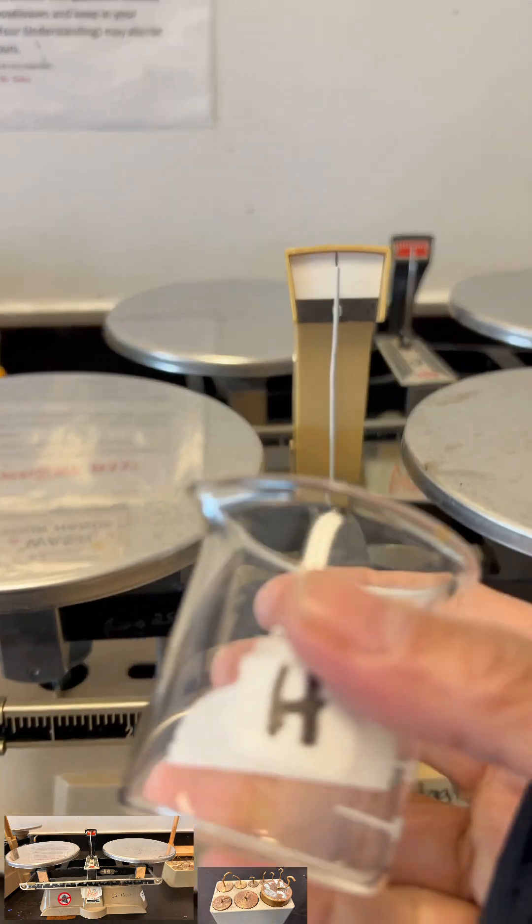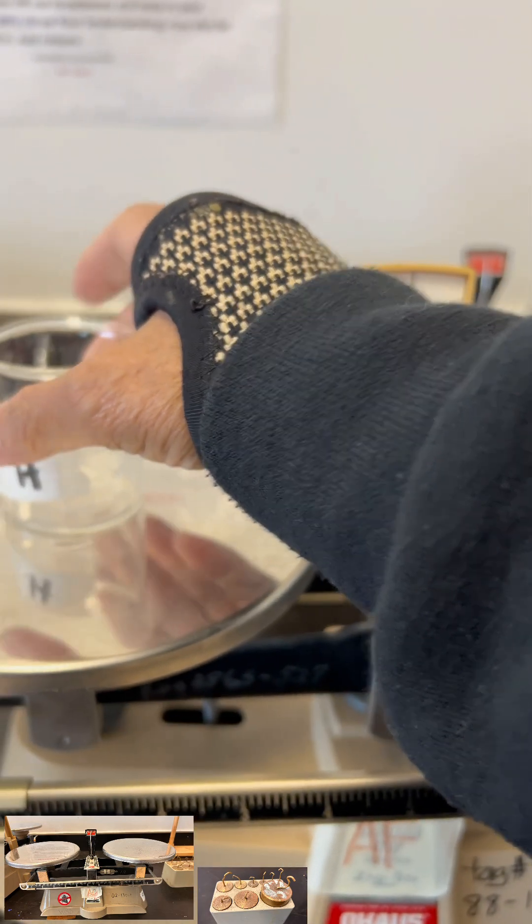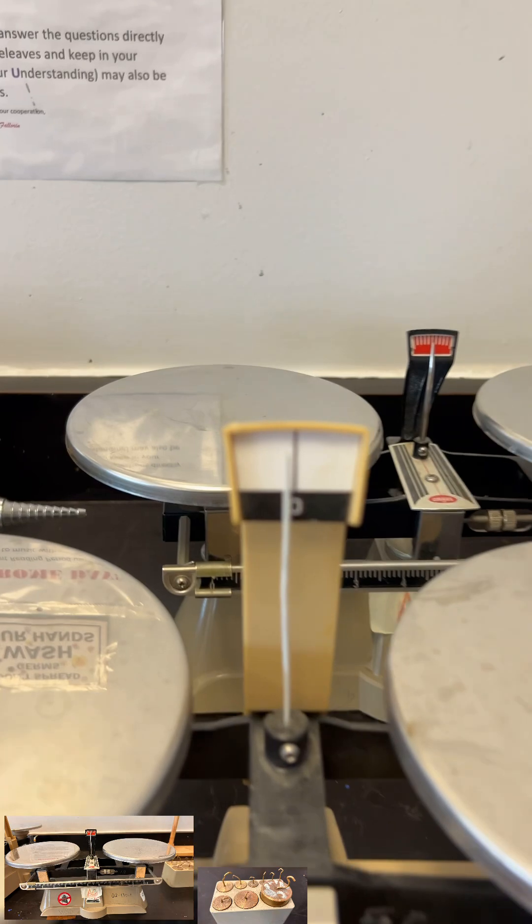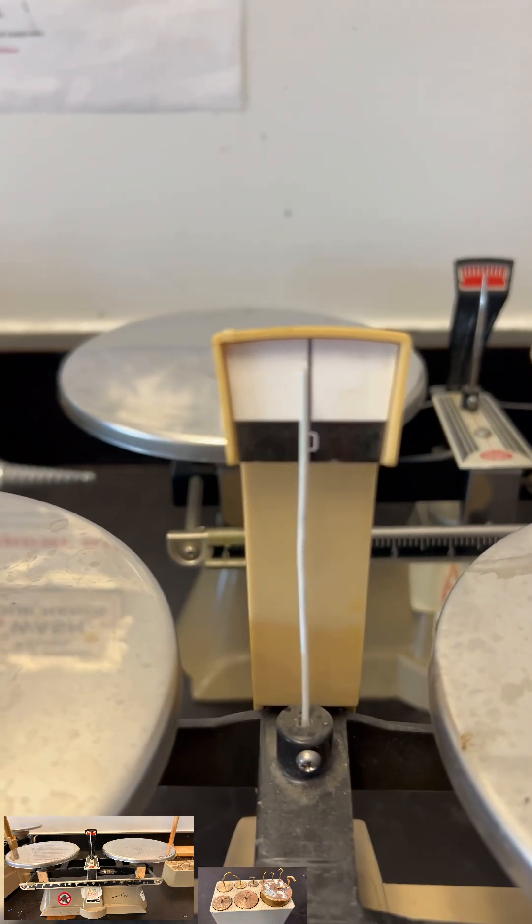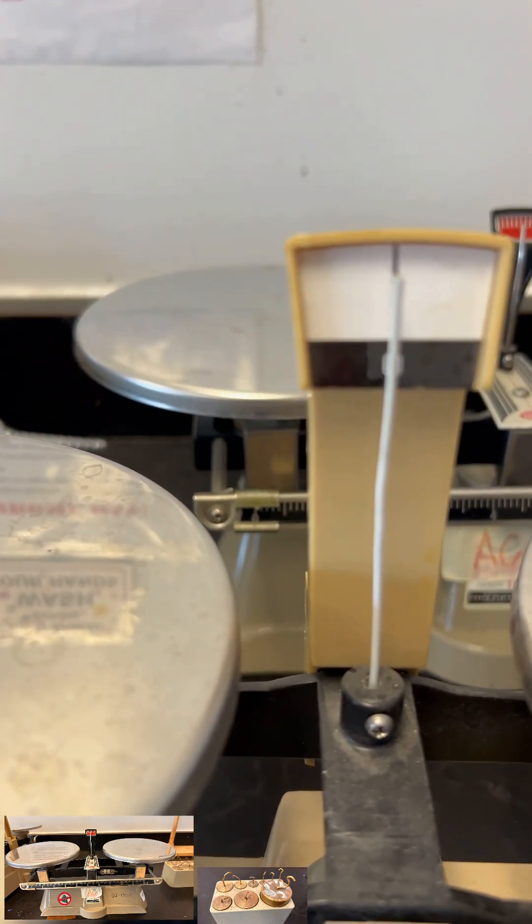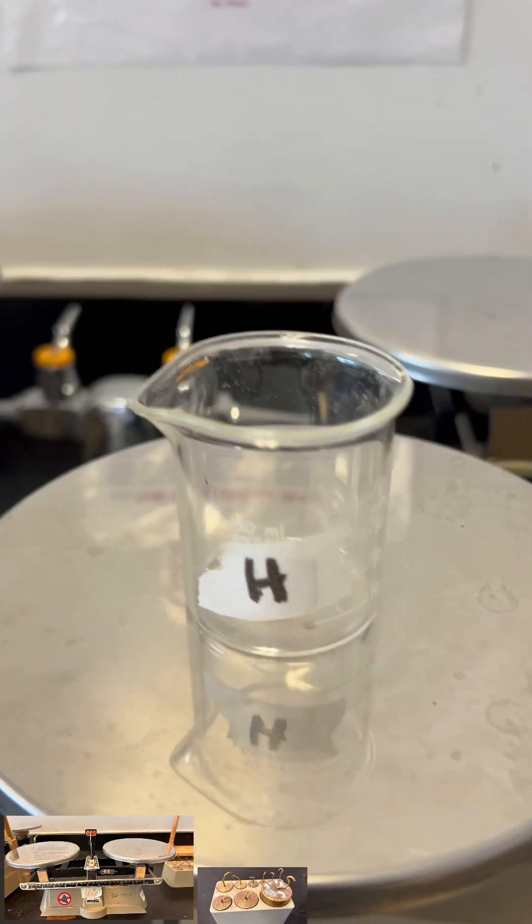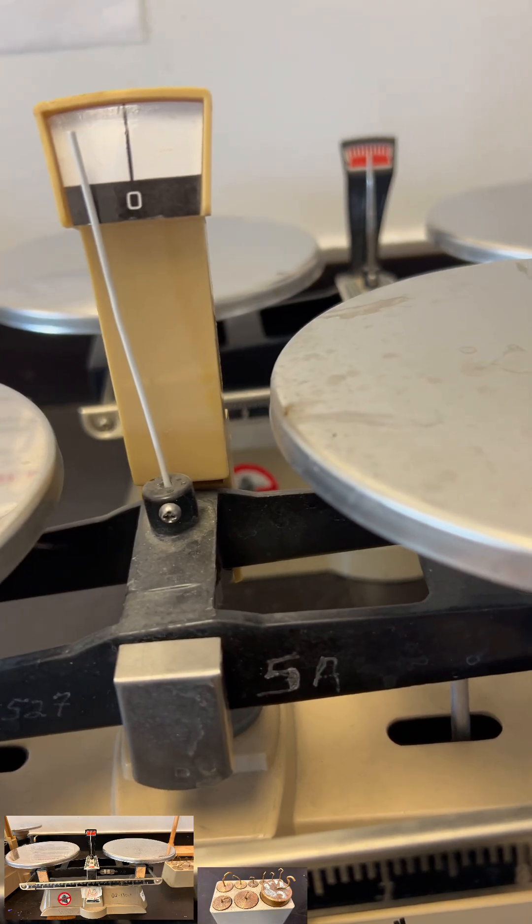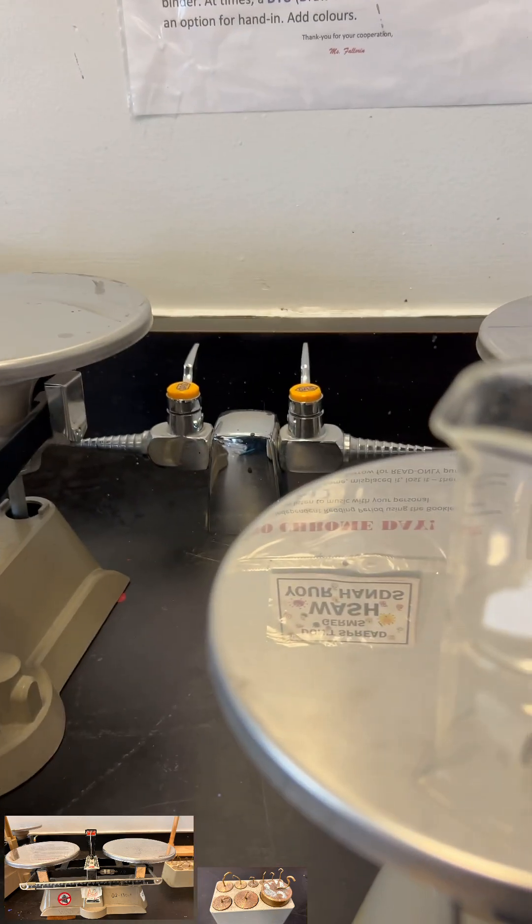Now let's weigh this small beaker. Of course, as always, we make sure that the needle point would be at the middle. So if I have this, for instance, again on the left hand side, you will notice that this is more than 10 grams. So what do we do now?